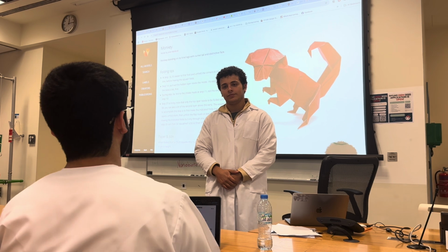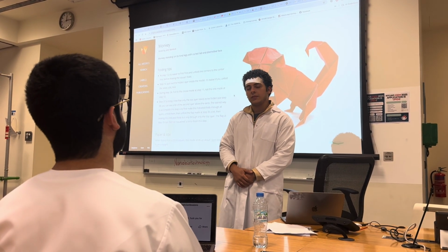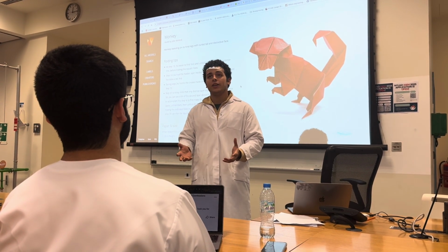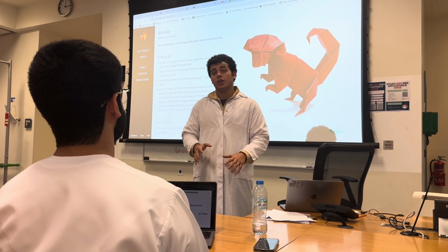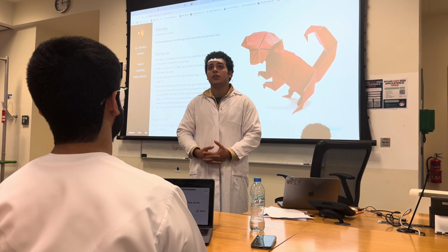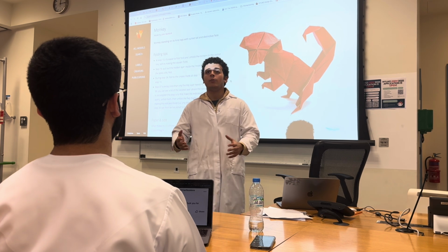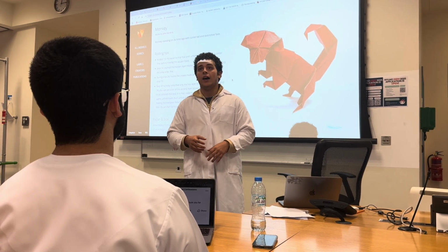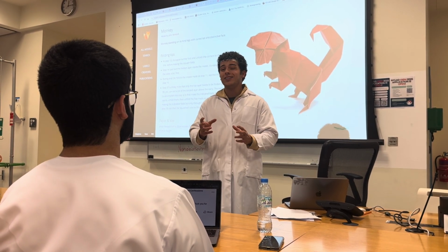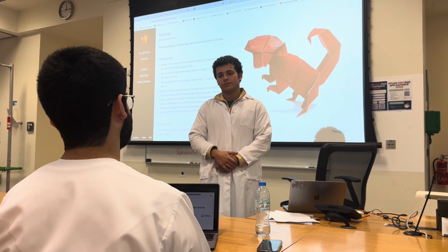Go ahead. Professor, what kind of applications does DNA origami nanopore technology have? That's a great question. DNA origami nanopores are especially promising for studying what we call epigenetic markers, such as DNA methylation, or for analyzing very specific molecular interactions. For example, because they're fully customizable, they could even be used for sequencing unusual or modified nucleotides that aren't very well detected with other traditional technologies. Thank you, Professor.